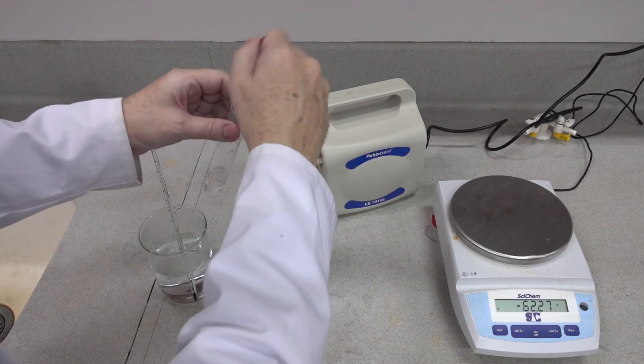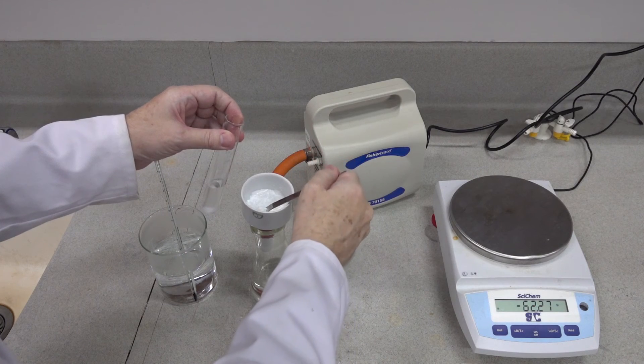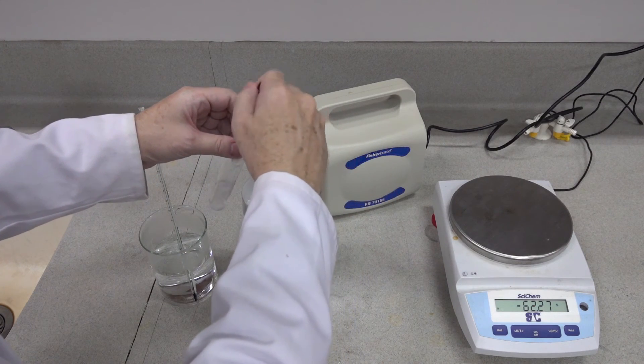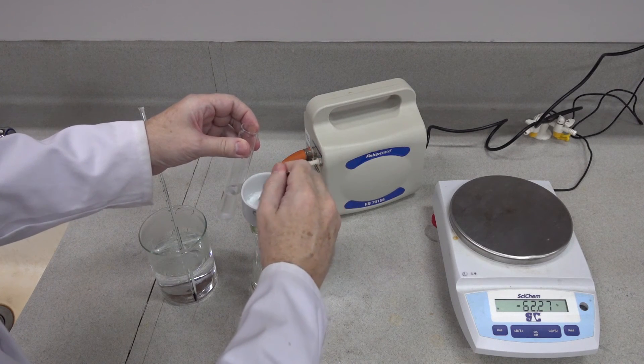Now at this stage, if you're calculating a yield, the temptation is to try and scrape every last bit from the Buchner funnel. If you do that, try not to take any of the filter paper with you.